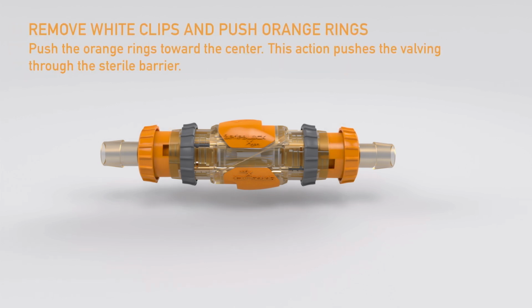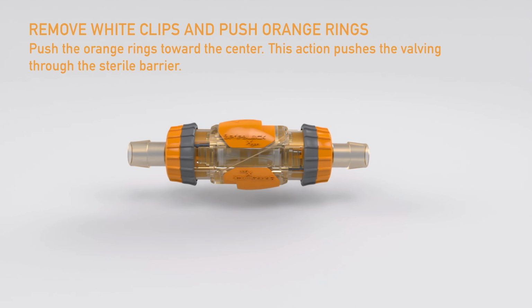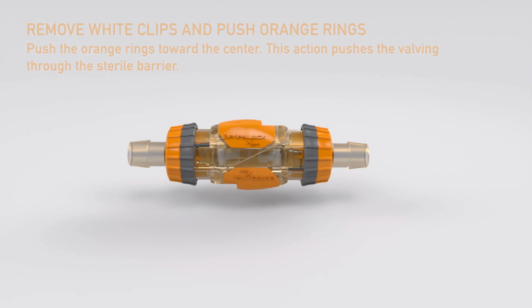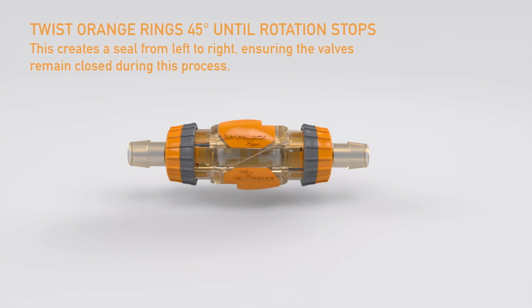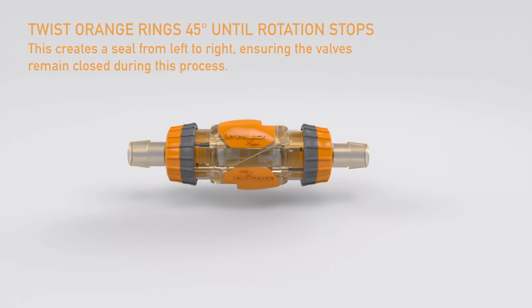Next, remove the white clips and push the orange rings toward the center. This action pushes the valving through the sterile barrier. Twist the orange rings clockwise with a 45-degree rotation until rotation stops to lock them. If rotating both rings at the same time, each hand twists in opposite directions. This creates a seal from left to right. The valves remain closed during this process.